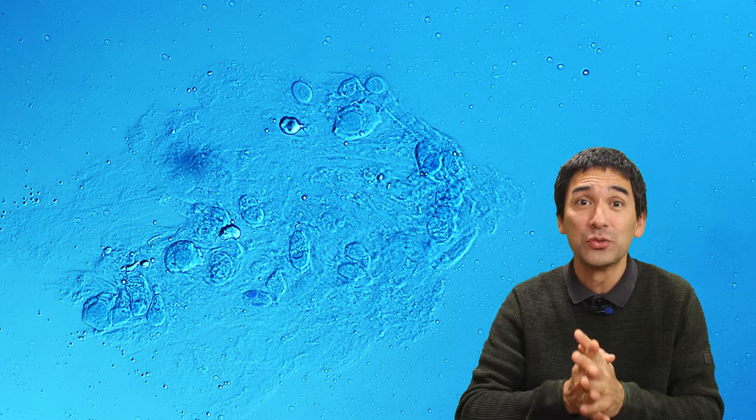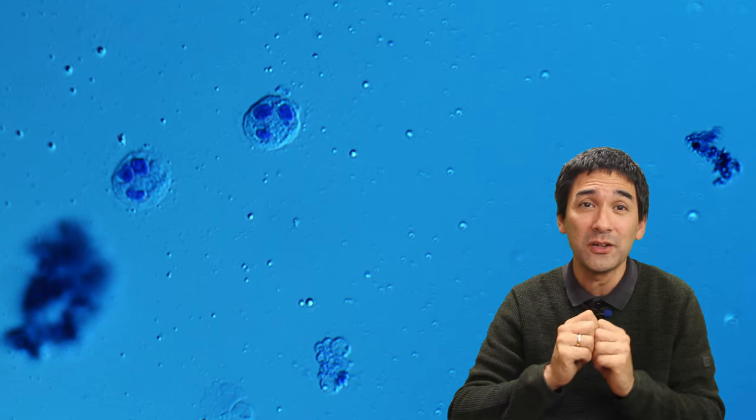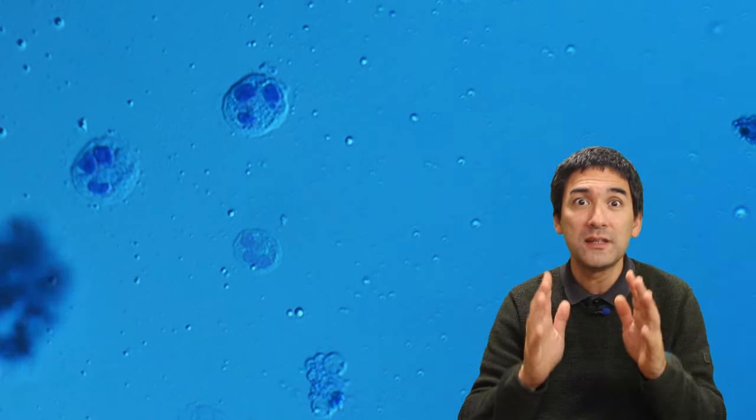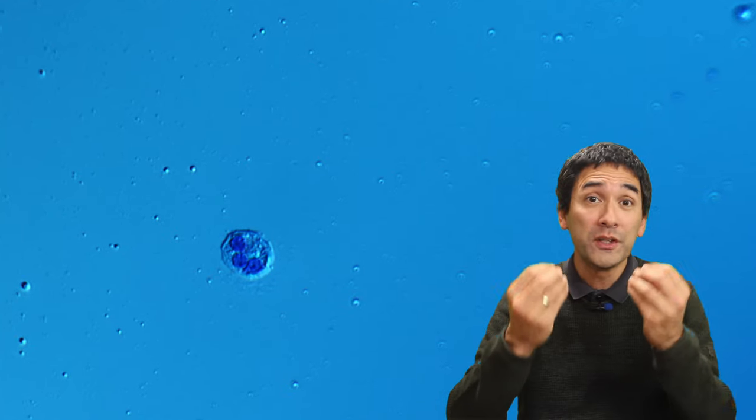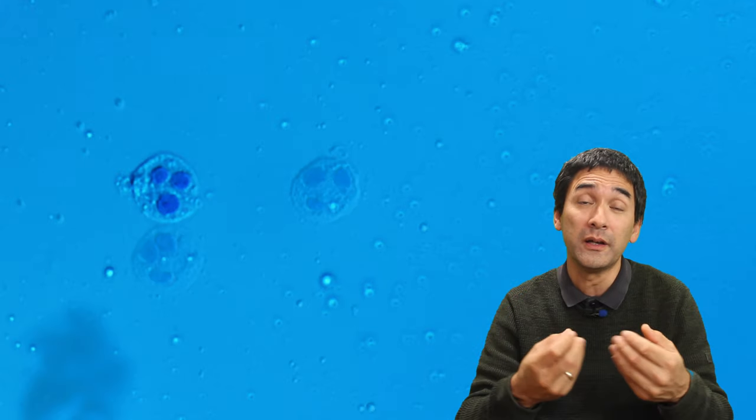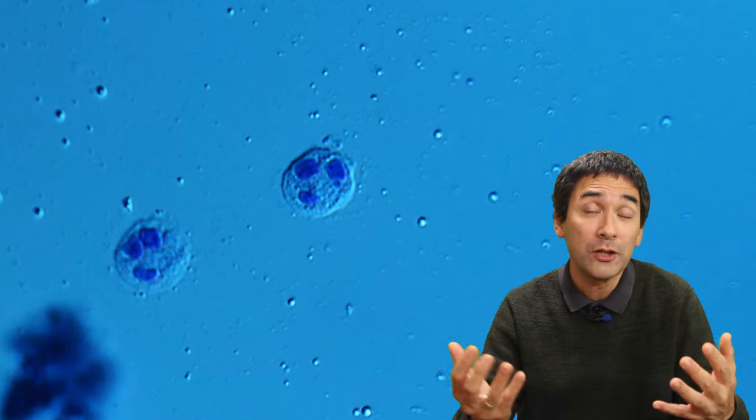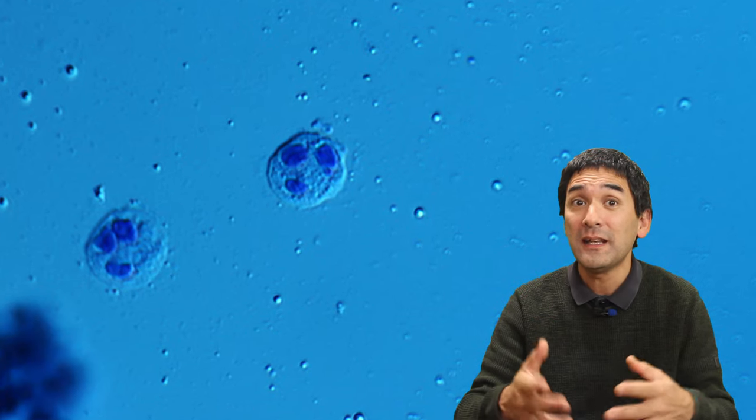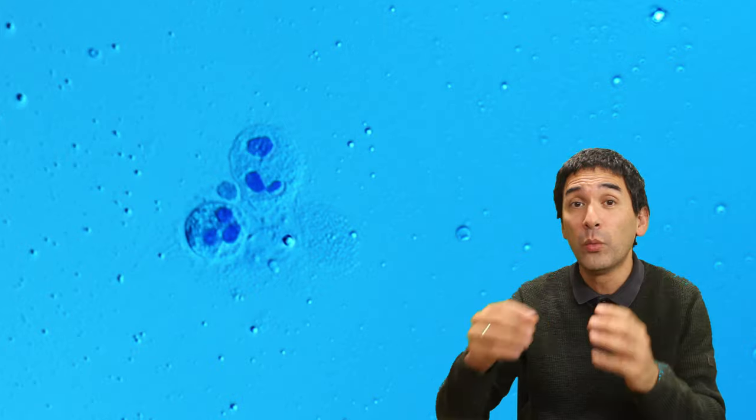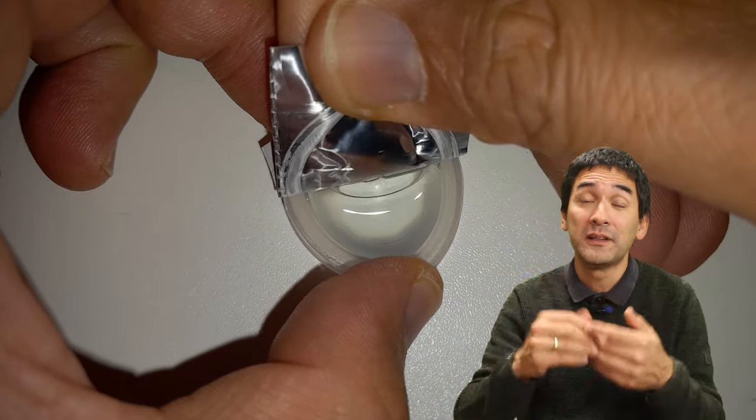The next thing here that is really interesting - do you see those two round cells with the three nuclei in each one of them? They look remarkably similar to white blood cells. I cannot believe this - what in the world are white blood cells doing on my eye? I found quite a few of them. I don't have an eye infection but maybe those white blood cells are there naturally to fight off bacteria, maybe it's a form of protection against infection. If you are interested in watching those white blood cells from blood, at the end of the video I'm going to put a link to a video where you can actually see the white blood cells in my blood and then you can compare them.